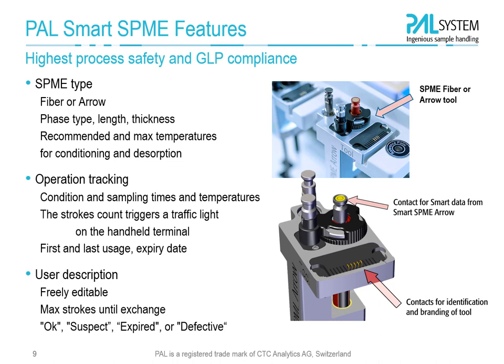On top of that, individual user parameters can be edited and are used by the PAL system, for instance, to monitor the maximum allowed number of samples. The status then is monitored in a traffic light bar on the handheld controller or in the virtual terminal.